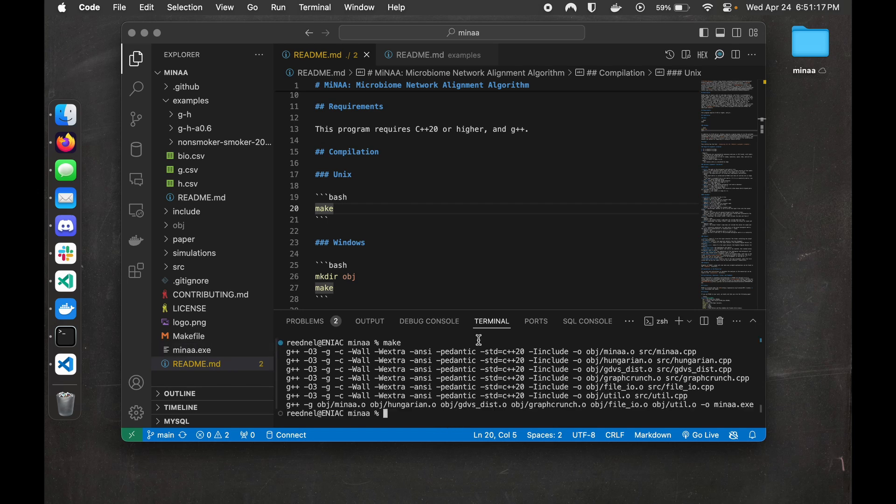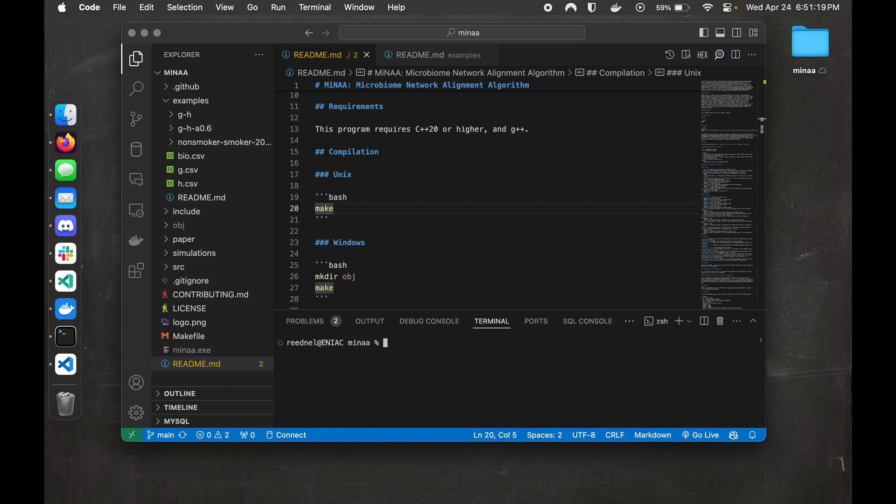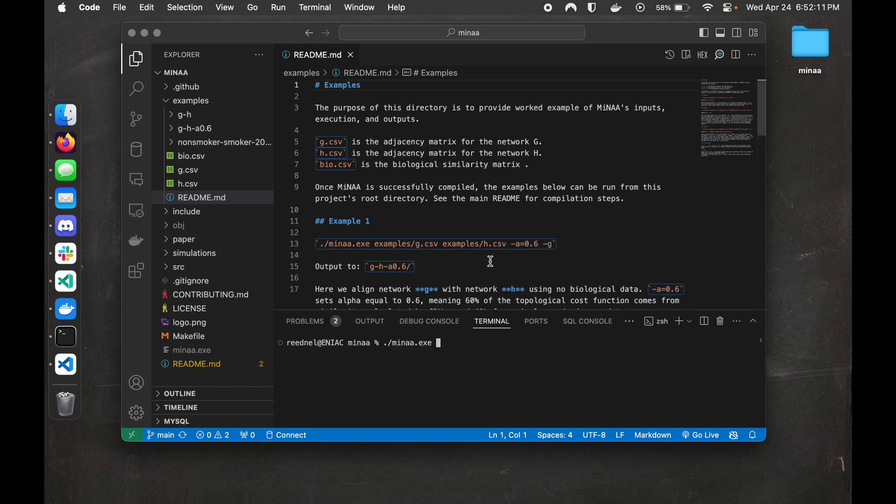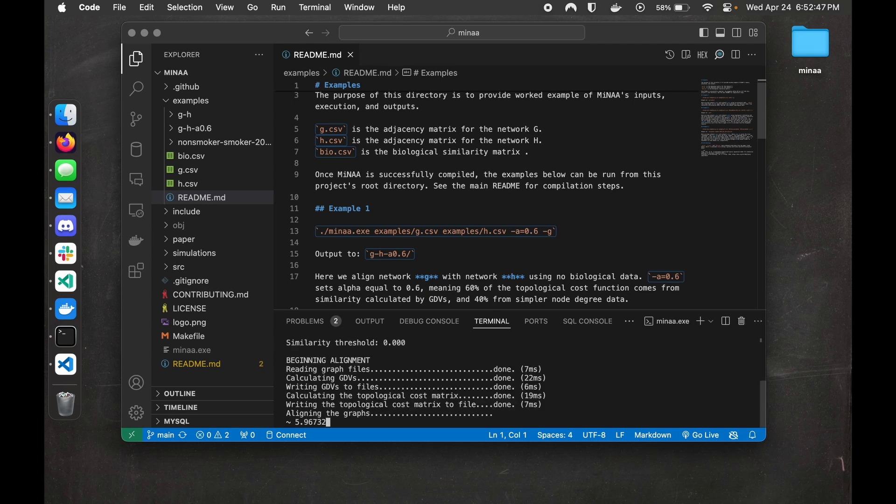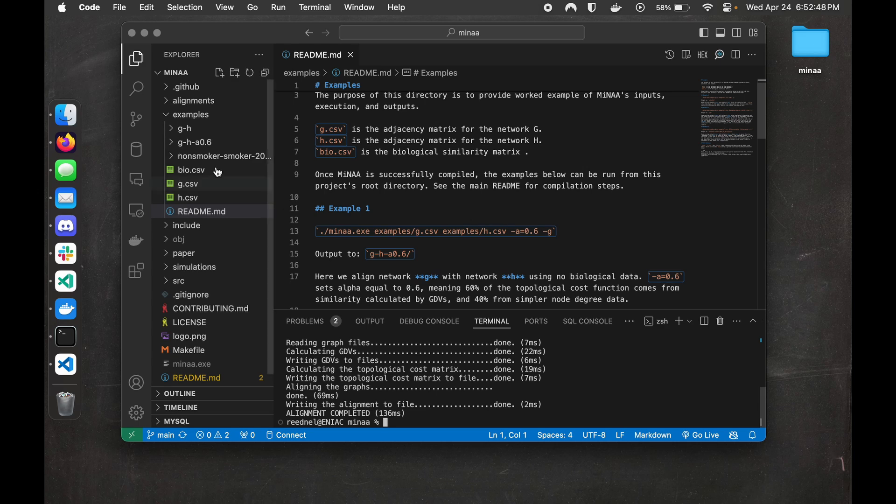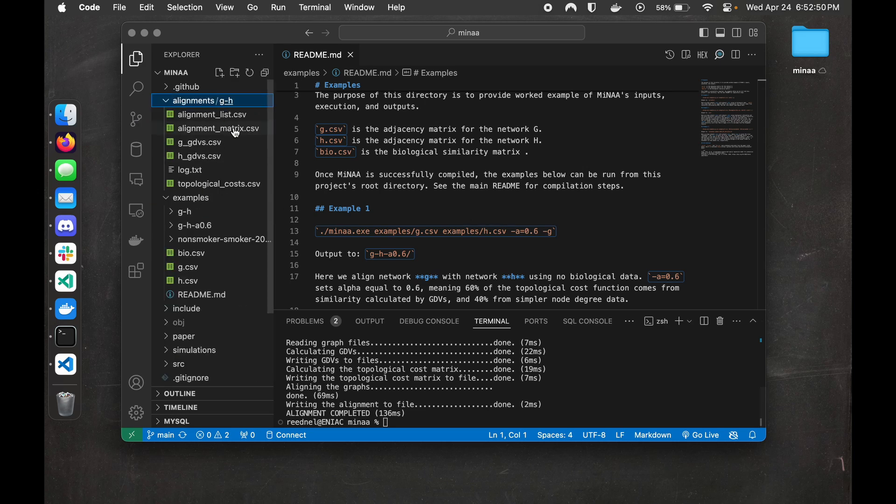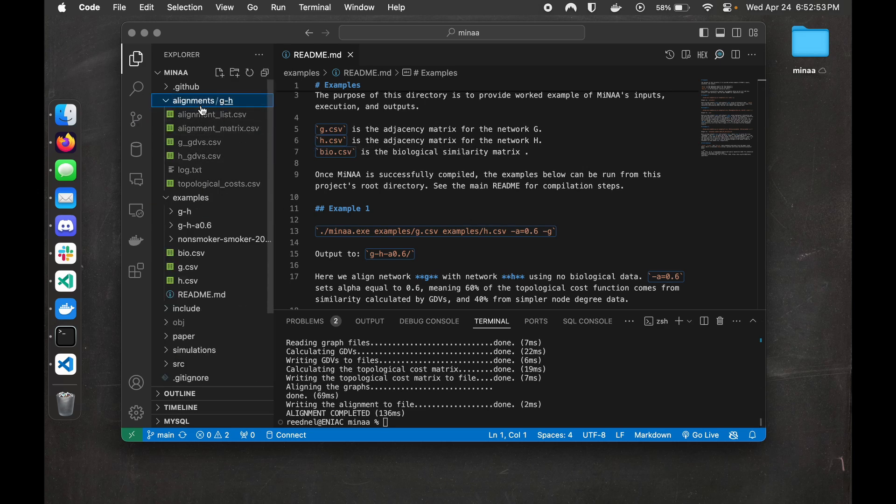Now to run MiNAA, it's just ./minaa.exe, and then the names of the networks we want to align. And there we go. It took 136 milliseconds, and we can see all the outputs in this newly created alignments directory.